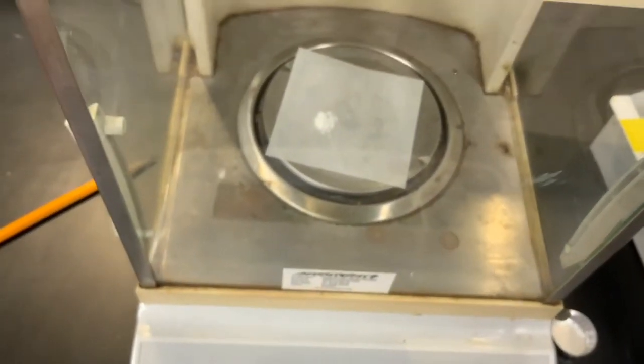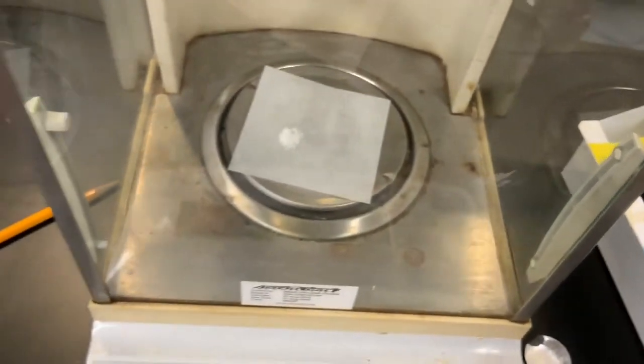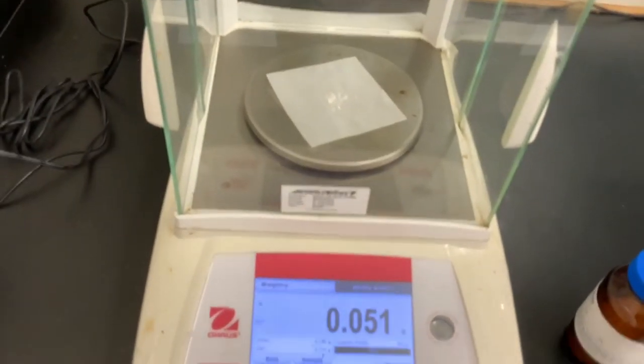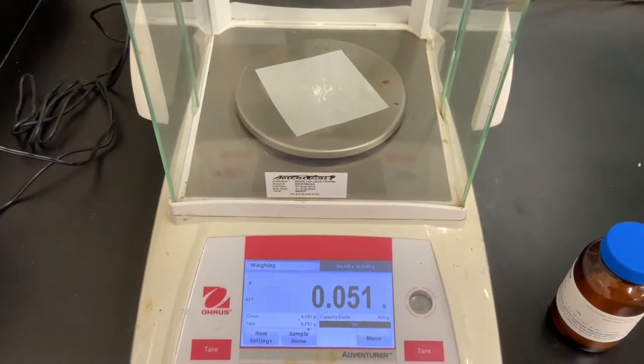Okay, so we're going to take benzocaine, our basic compound. We are going to take 9-fluorenone, which is our neutral compound, and we are going to take benzoic acid, which is our acidic compound, and combine them into the same culture tube.